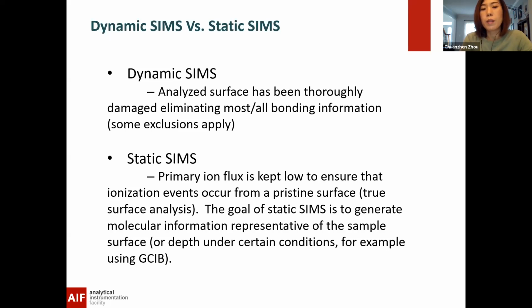Or sometimes if you are using GCIB, which is a gas cluster ion source, you can do a molecular depth profile. That's a whole different story, using another type of bulky ion source to maintain the molecular information. And unfortunately, in our instruments, we don't have this source.